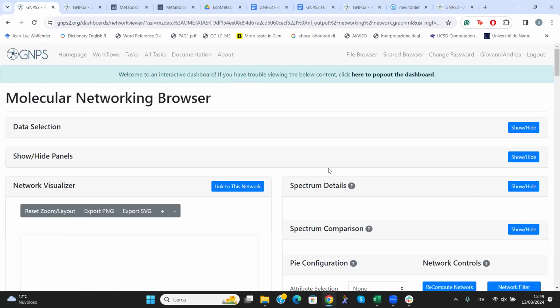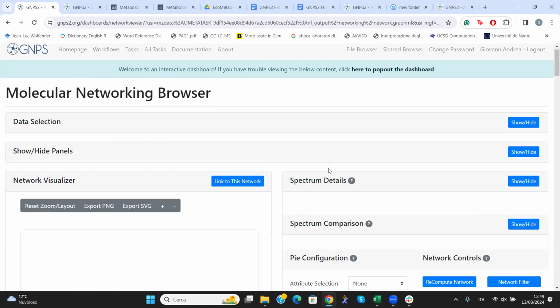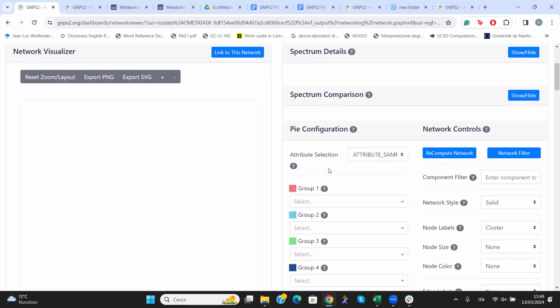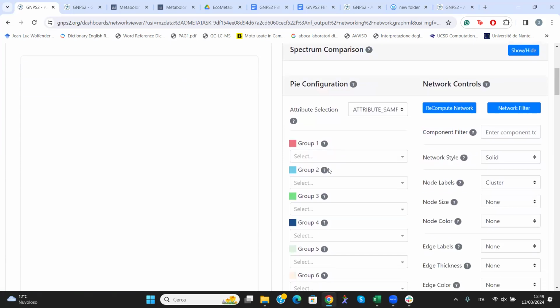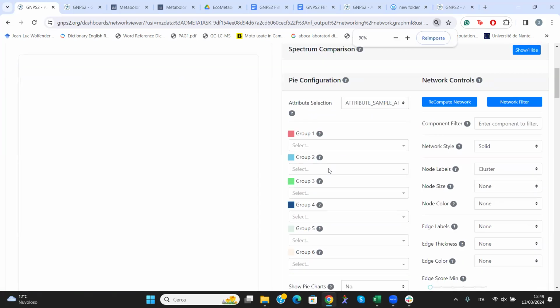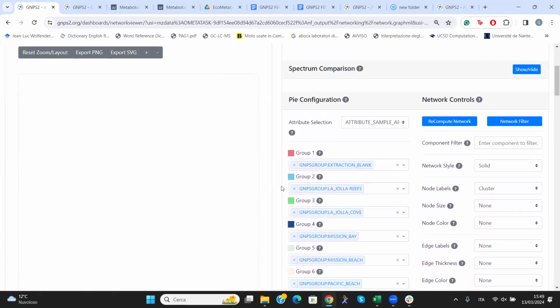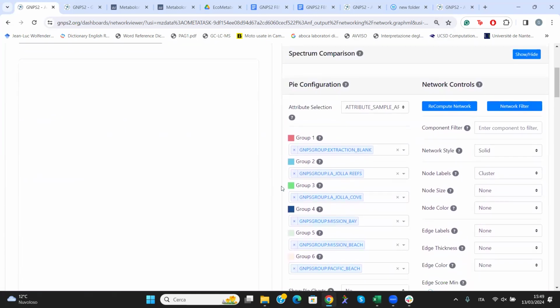So you click on this. Please, everyone can do it. It takes a bit to upload. Is everyone on this window? Are you uploading your network? Great.